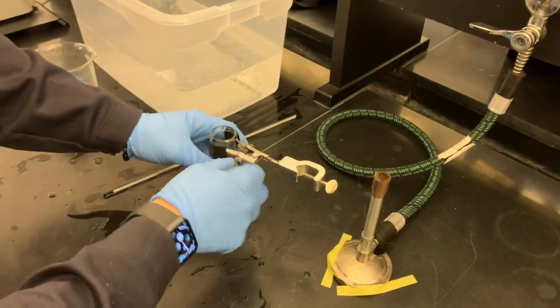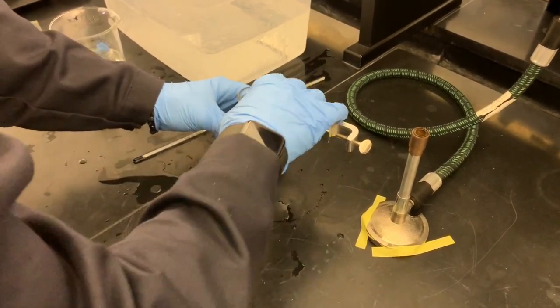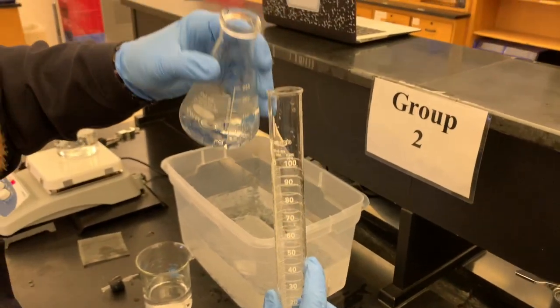The amount of wild deviation in this experiment is pretty impressive, and it gives you more respect for the guys who tried to do this in the 1800s, for sure. All right. And now we will transfer into our flask.